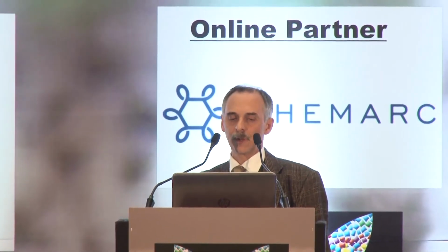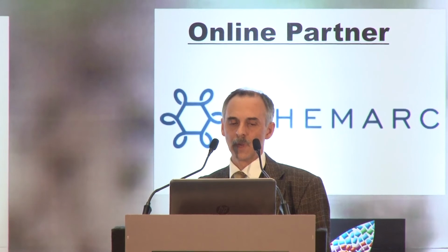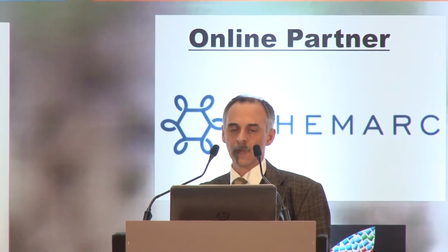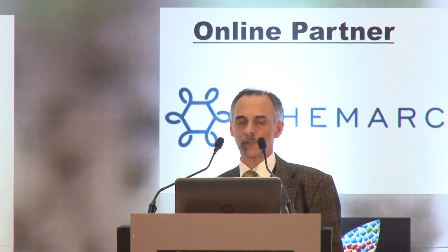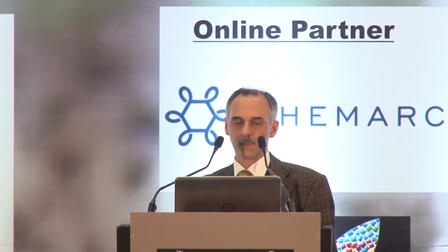We think that we can, in the next year, start with a new system where we use a near-infrared spectrometer, which has a full resolution in the area between 1,600 nanometers and 2,500 nanometers, with a resolution down to 8 nanometers. So we have a much better possibility to measure more exact data in this case.